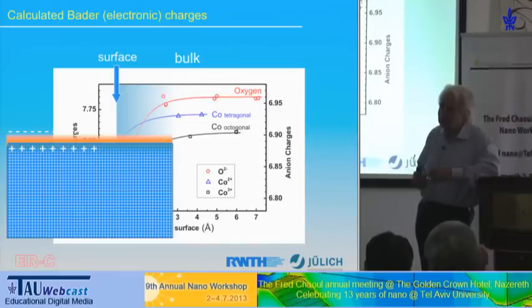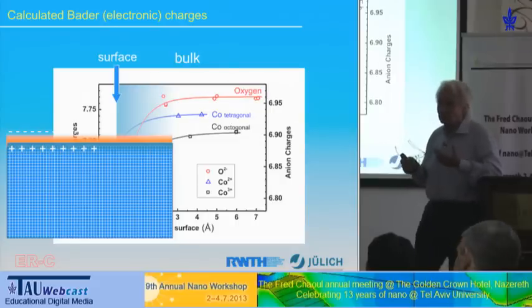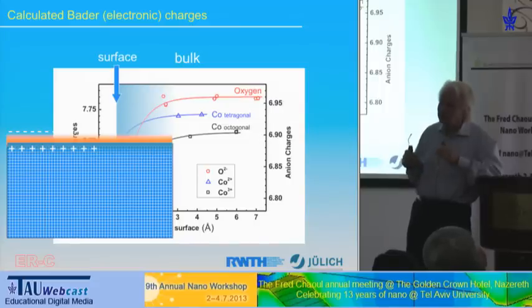But I think it's not really shown that the conductivity effect is just concentrated to one atomic layer. So I think the best work that has been done, in my opinion, is high-resolution X-ray scattering work or neutron scattering work. And there, the resolution is not a single layer. So I think that's not an objection.